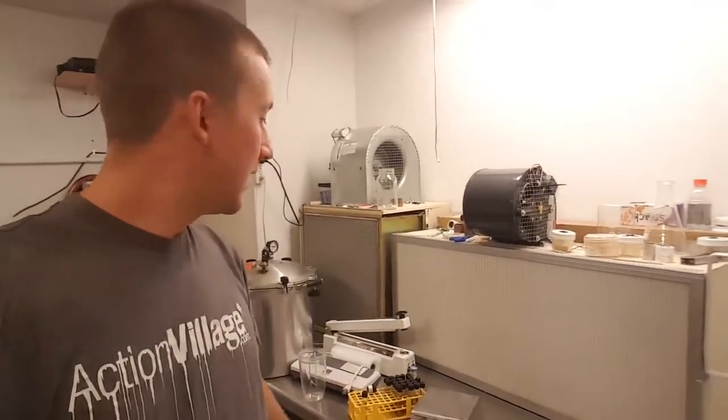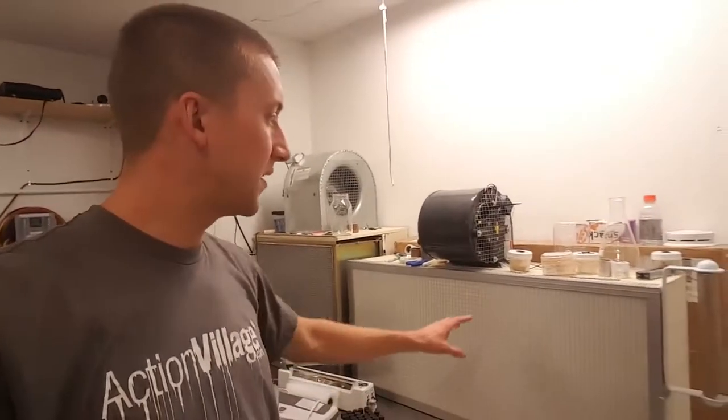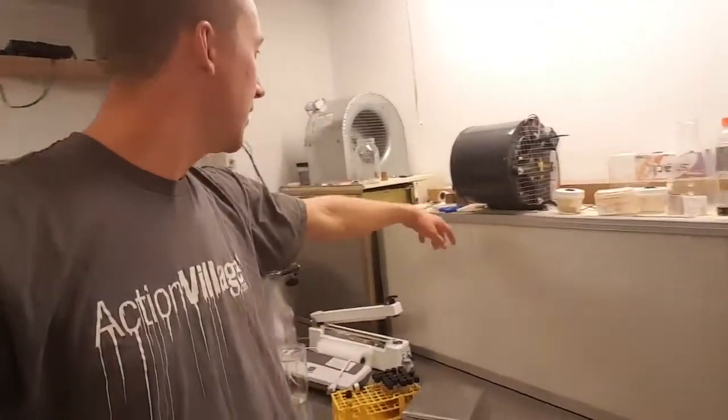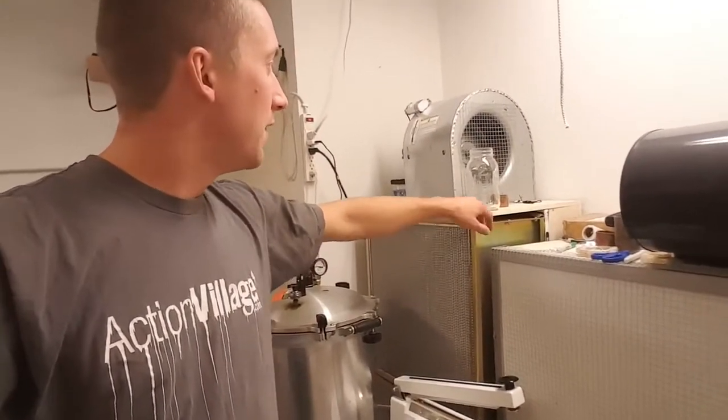Welcome. This video is about flow hoods — the two flow hoods that I have. It's about six feet wide of flow hood total, which is beautiful if you're working by yourself or with one other person. This is a 20 inch by 40 inch flow hood and this is a 24 inch by 24 inch.